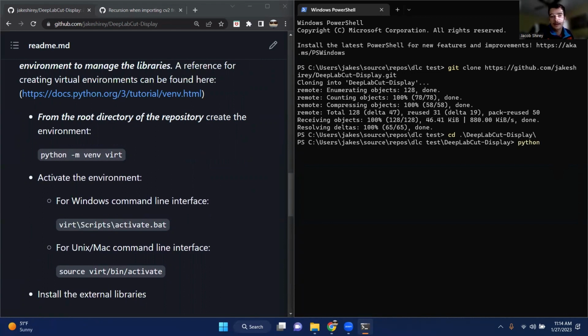I should note that you are going to need Python installed on your computer in order to run these commands. So the interpreter, there should be a lot of resources online on how to download and install the Python interpreter. But I'm not going to get into that. So you might want to check out python.org. That's the main Python website, and they should have some good resources on getting Python.